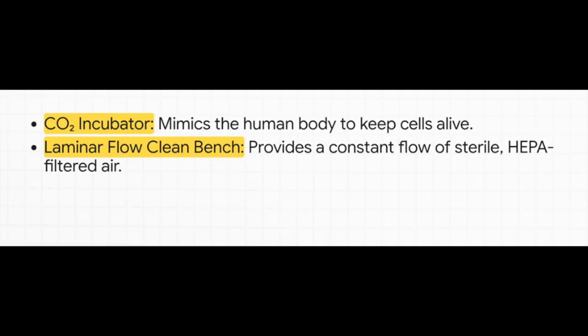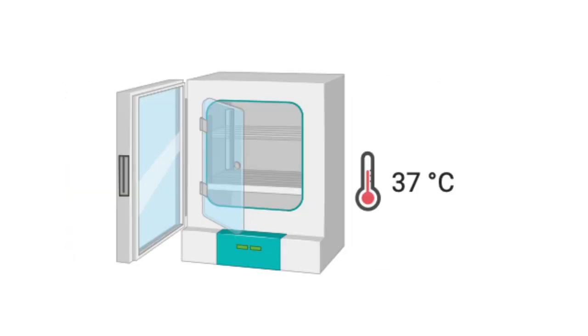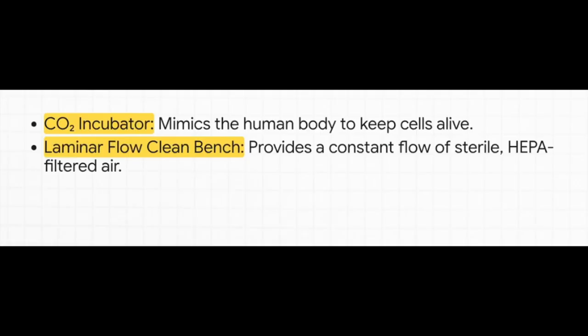The next step, we need to decontaminate the incubator. This is where you put your cells, the home for the cells. The incubator is warm, humid, and may be full of CO2 for mammalian cells, for human tissues. And this is perfect for cells, but also perfect for contaminants. You have to nuke this space.